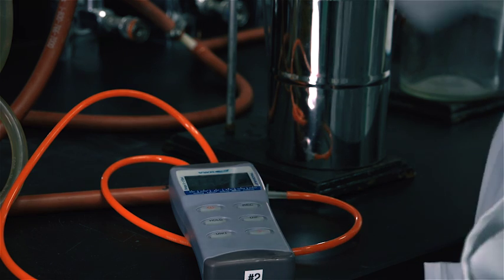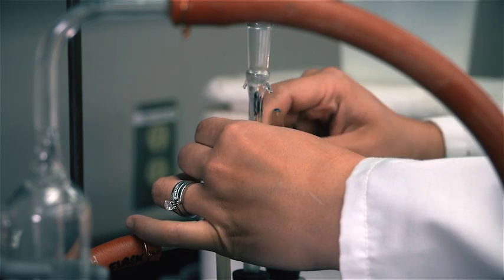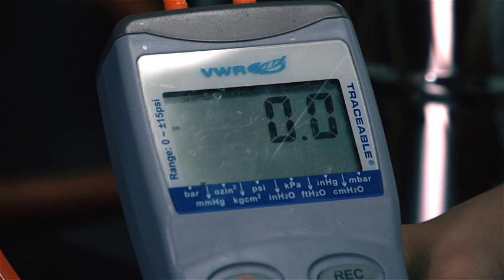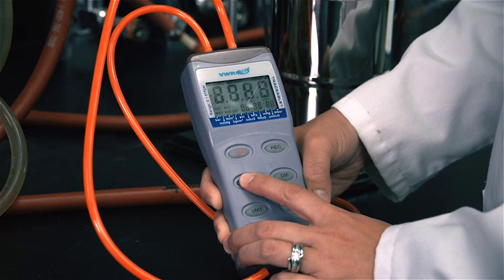To zero the manometer, make sure the vacuum is off and the system is open to the atmosphere. Turn on the manometer and push the hold button for 2 to 3 seconds.